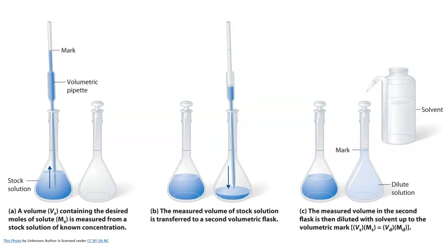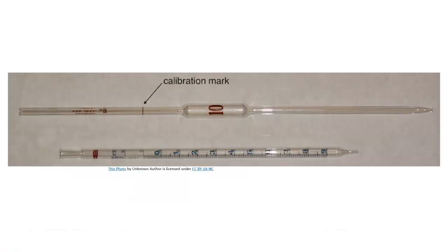And this is basically what we're looking at. We're going to condition the pipette. You're going to draw it up with a roller. You're going to put it in a waste container, not into the beaker that you're going to dilute your reagent. You'll repeat that process 2 times. And this is what it actually looks like.